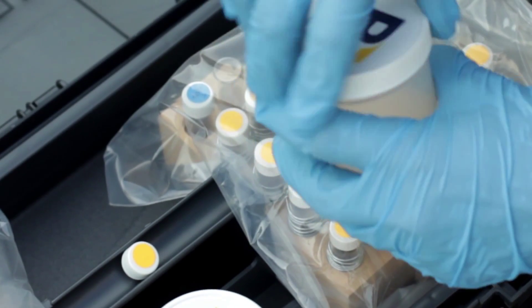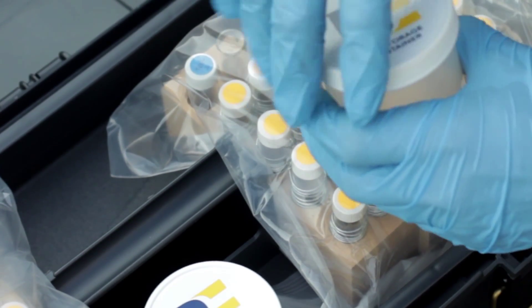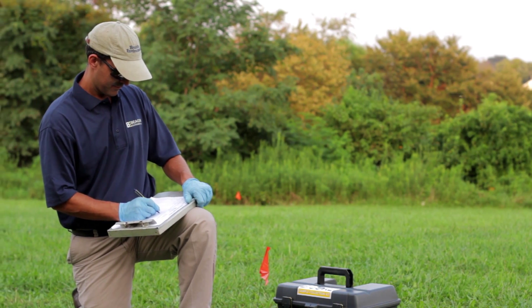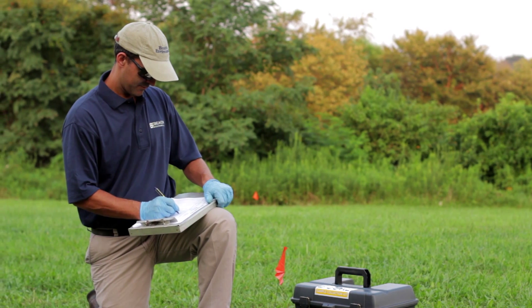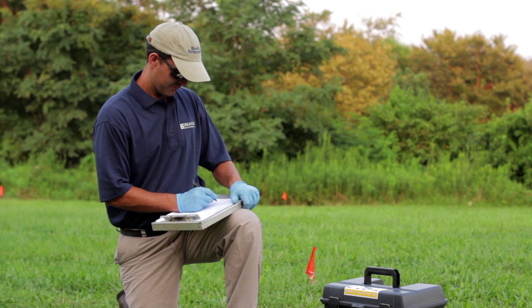Place the solid cap in the cap storage container and close the sample collection kit. On the provided chain of custody, record the field sample ID, the date and time of emplacement to the nearest minute, the sampling hole depth, the type of surfacing, and other relevant information.